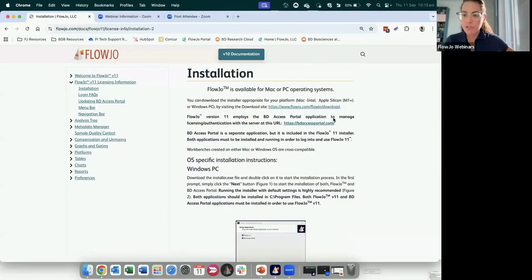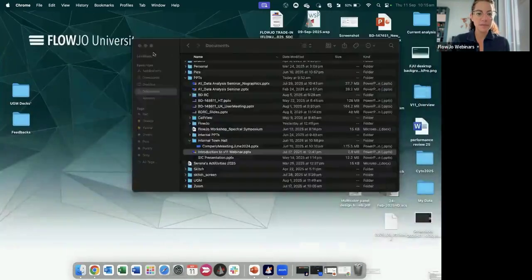Okay, so let me pause for a second. This is a question that I will ask in a second, Mark. Okay, so we will cover that when we get there. If there are no other questions regarding the installation and the download of FlowJo version 11, let's dive right into the software.